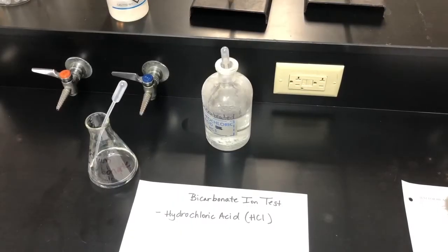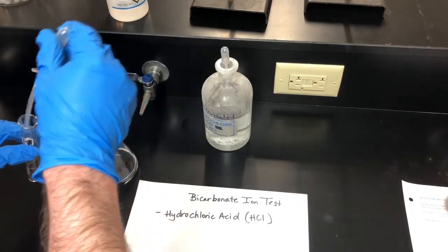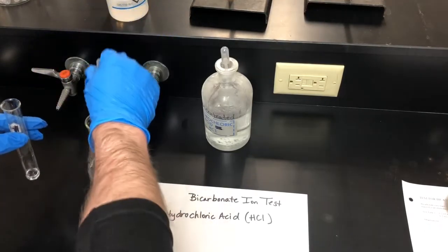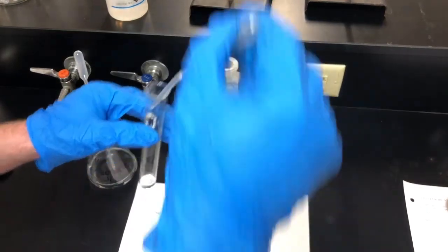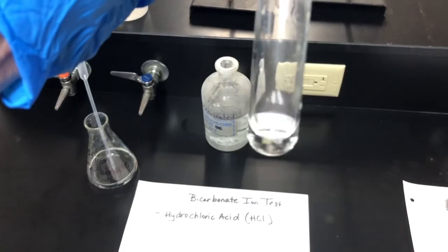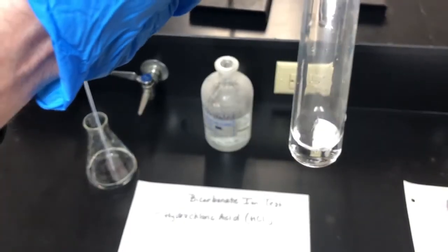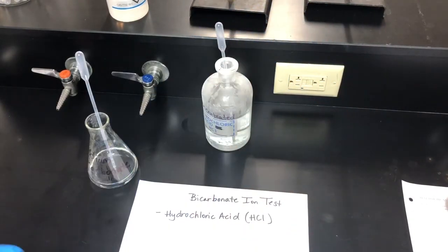So the next test we'll be looking at is the bicarbonate ion test. Okay. For this, you're going to need sodium bicarbonate. So this is what it should look like. So we'll do a squirt of sodium bicarbonate. And then we're going to do a squirt of hydrochloric acid. Okay, so what should happen is it should fizz. There were bubbles produced. Okay, so what we're going to do now is we're going to look at our unknown and see if it does the same thing.